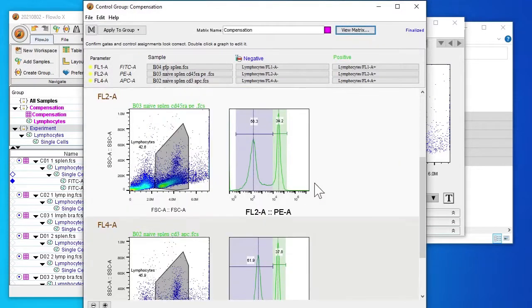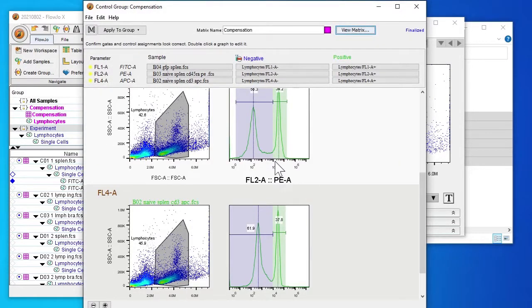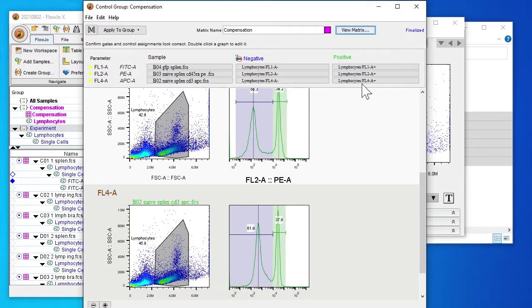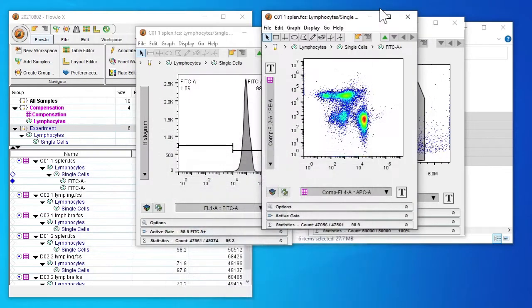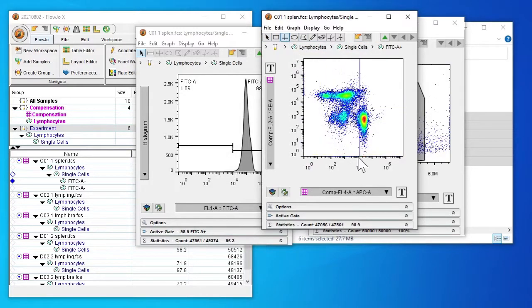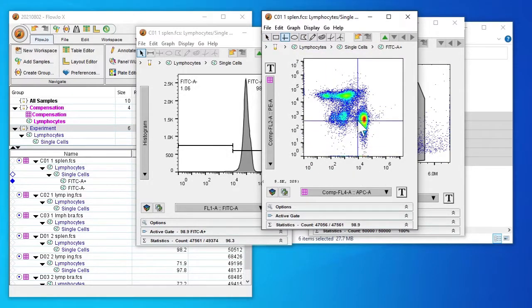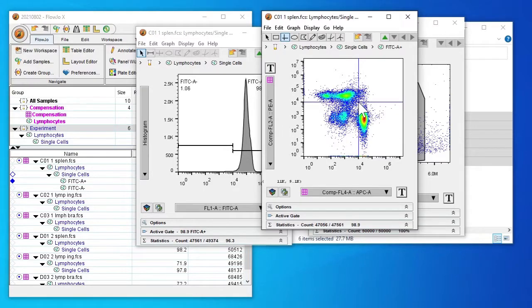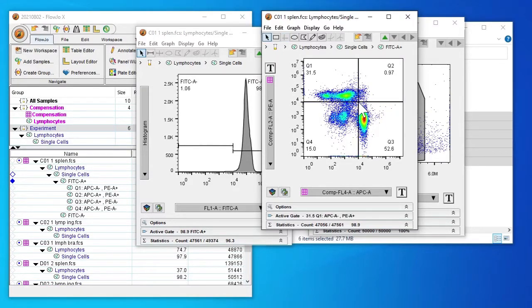So again we can come back to our compensation window and look at our cutoffs and for both they are 10 to the power of 4. This may be different depending on the sample that you have. And I set the quadrants like this here both 10 to the power of 4.